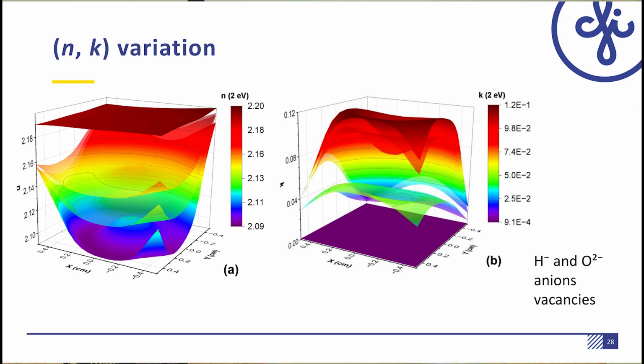As irradiation progresses, we see a clear increase in extinction coefficient and corresponding reduction in the refractive index, indicating evolving optical absorption and structural changes.